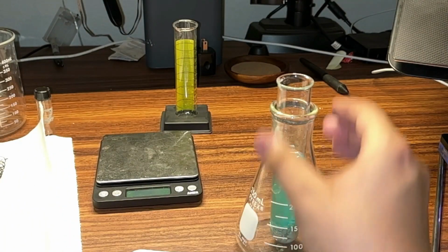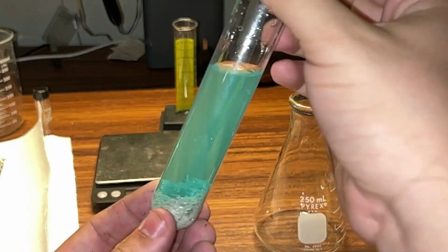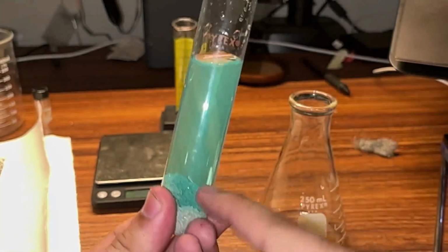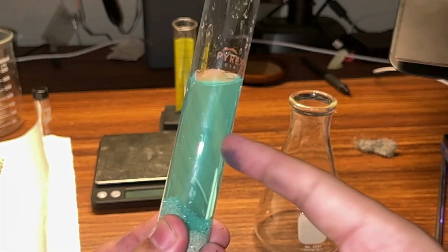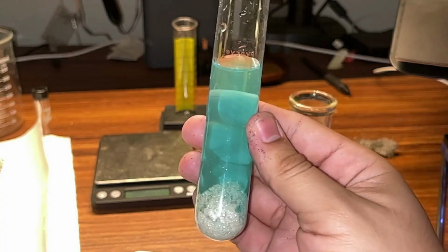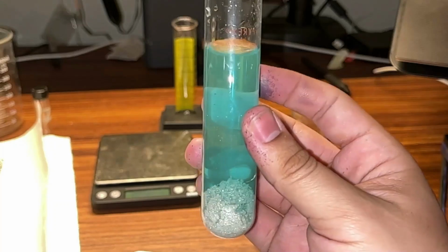And while I do that, I'm going to start working on separating my silver from the rest of my contents here. By the way, look at it. It's blue now. It was not blue before. Before, like when it was silver nitrate solution, that was a clear, colorless solution. And now it's this blue color.